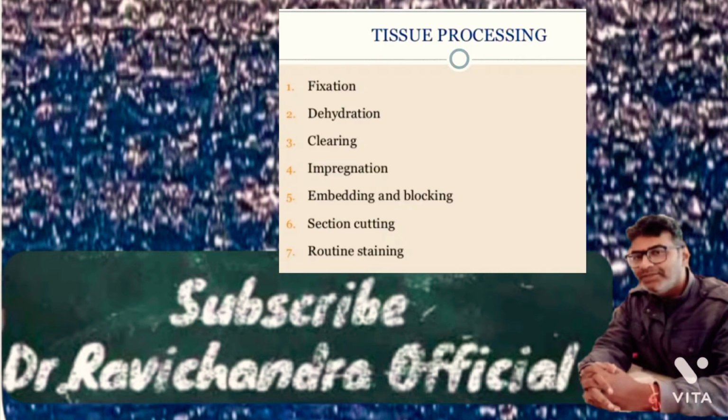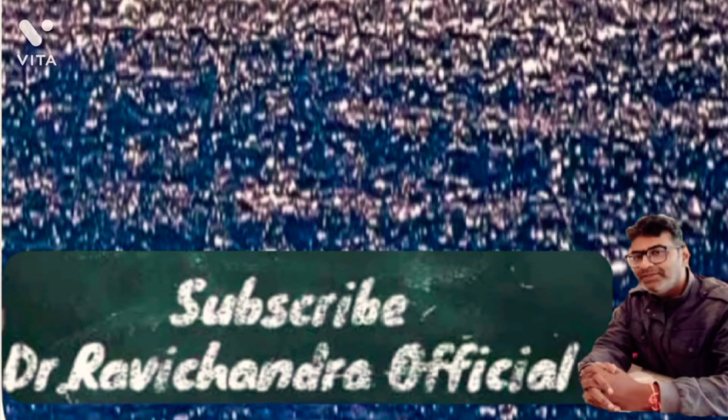There are mainly two steps in the preparation of a slide. One is sectioning of the tissue and the other is staining of the tissue. Sectioning of the tissue is of two types: frozen sectioning and paraffin sectioning. Staining of tissues is of two types: routine stains and special stains. Routine stains are done by hematoxylin and eosin, H and E stain, and Papanicolaou staining by PAP stain.